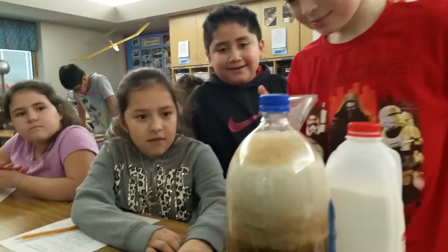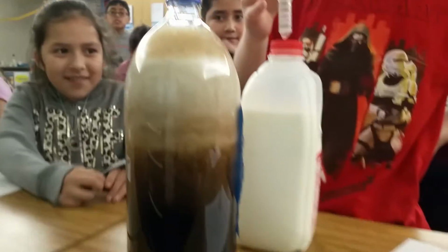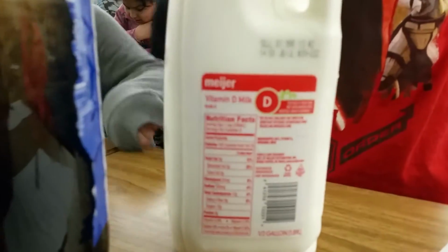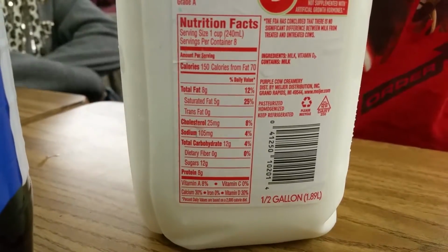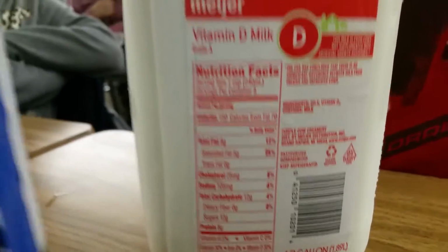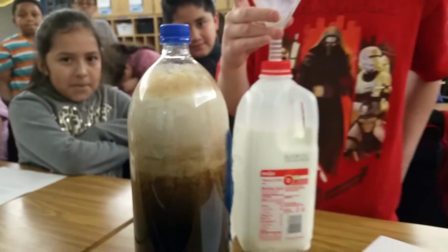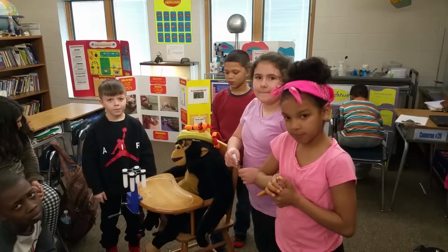Now, Yaneli, we know that milk has ingredients. What are some ingredients in milk? Water. Water's in milk, so we should see some clear water in here. What else, Jillian, is in milk other than water? Fat. Yeah, if we look on our label here, you can see that there's quite a bit of fat in milk. It says here, calories from fat, 70 calories out of 150. So we should see some fat that separates out from this colloid. And we'll check on that in just a couple minutes.